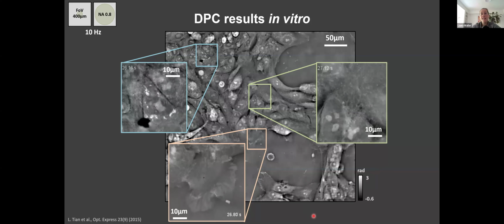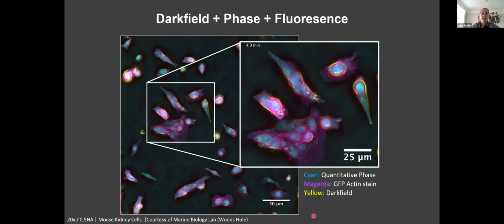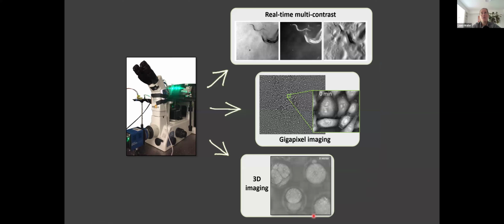It has good fidelity. It's an incoherent microscopy method, so you get the full doubled diffraction limited resolution. You get the incoherent diffraction limit of resolution. And it's really stable type of phase imaging because you have partially coherent illumination. And it's cheap and simple to implement. You can do it simultaneously with fluorescence images, or you can time interleave with these dark field illumination methods so that you can get different contrast modalities pretty easily and all in one microscope. Okay, so that's real-time multi-contrast.